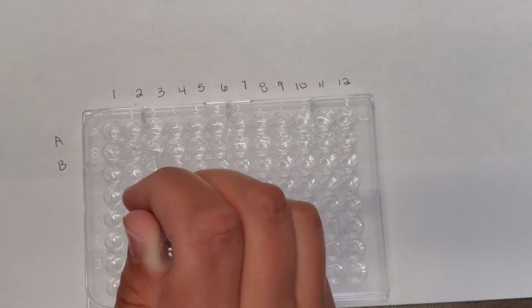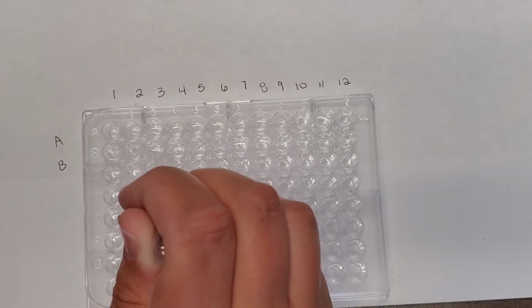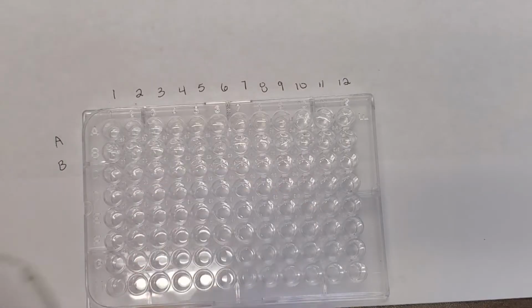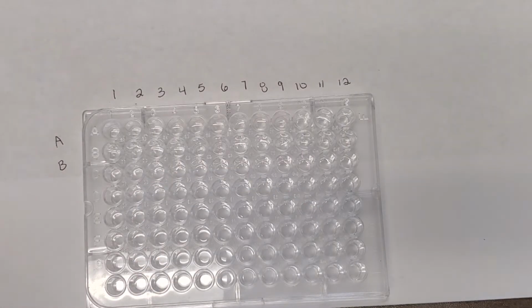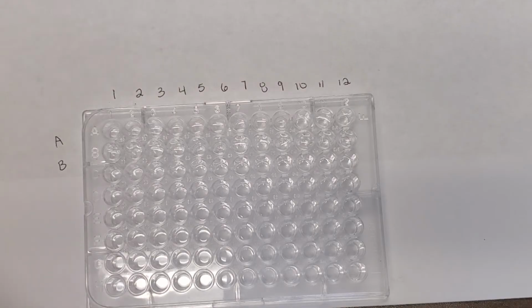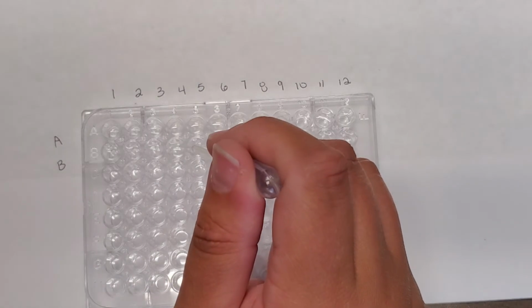Once again, 3 drops into each well. Now we're done with patient C. We're going to go to patient D. Patient D is now going to go into wells B4 through 6.